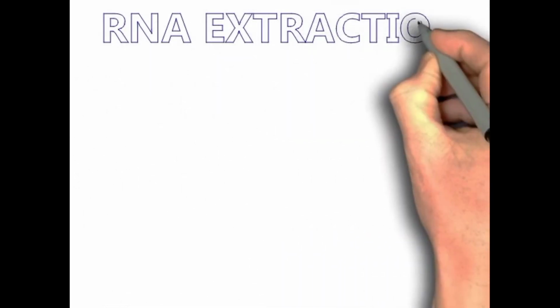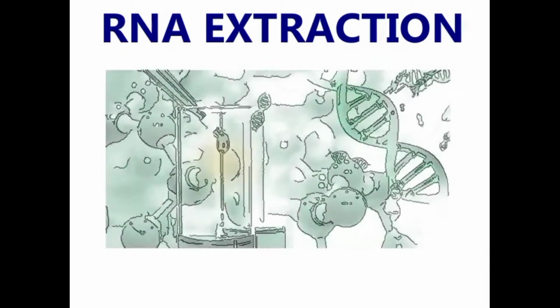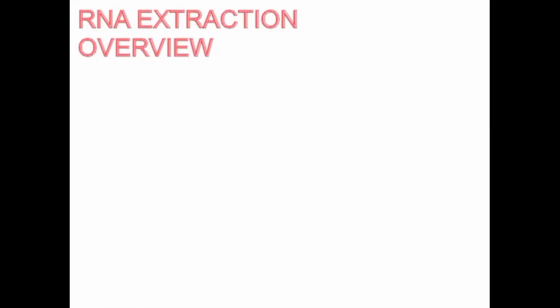RNA extraction. RNA extraction overview.